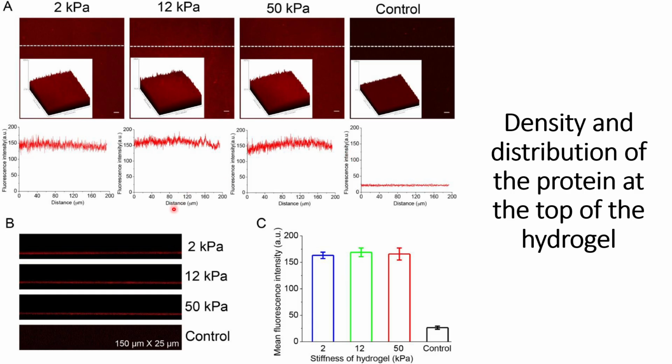In panel A they checked whether the distributions are evenly expressed or not, in the XY plane. And in panel B they checked the distributions in the Z plane, and in the Z plane they can see that only in the top layer of the hydrogels are they able to see the signals, but not in the bottom layer of the hydrogels.